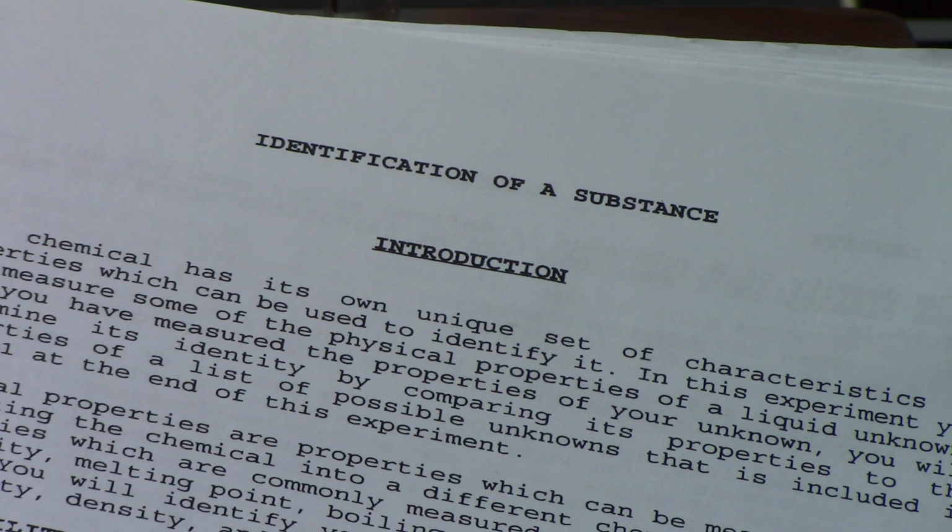Okay, so what I'm going to do is the first 2 parts, solubility and density. I want to do those first. I will add the boiling point as an added video, but it'll still be part of this lab.